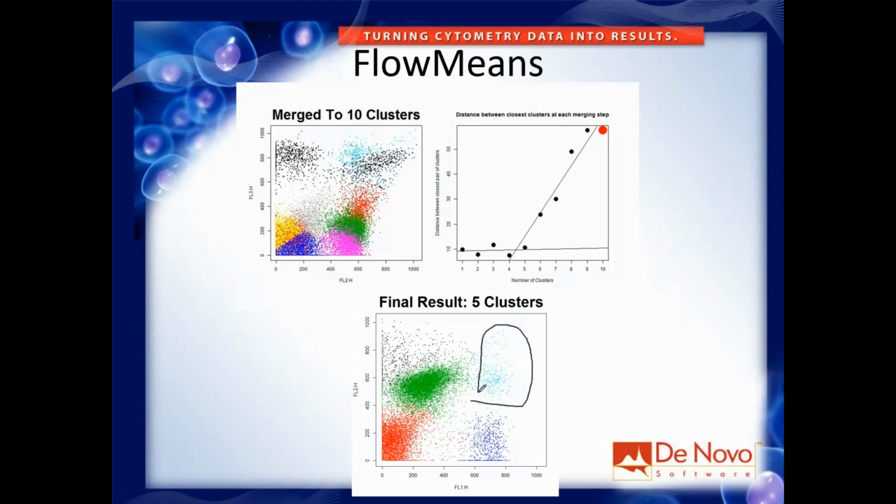And you can see that, you know, at least looking at FL1 and FL2, it seems that those did a pretty okay job of identifying different populations within my data. Now, is this top left thing, would you really consider this population different than these green ones that just sort of spread out here more? I don't know. You sort of have to look at other detectors, other channels. Maybe it is more appropriate to have picked actually 4 different populations, and this black one would have gone away and merged with the green one, and they're really the same thing. Again, none of these algorithms are perfect.